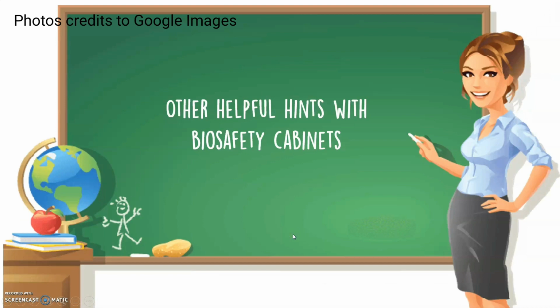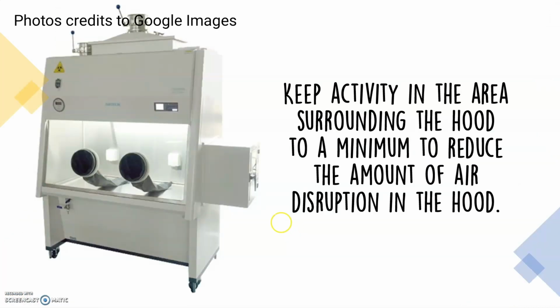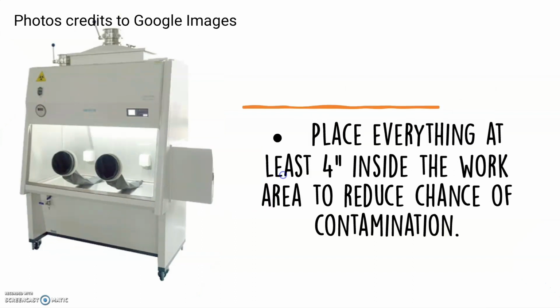Other helpful hints with biosafety cabinets: you have to keep activity in the area surrounding the hood to a minimum to reduce the amount of air disruption in the hood. Place everything at least 4 inches inside the work area to reduce chance of contamination.